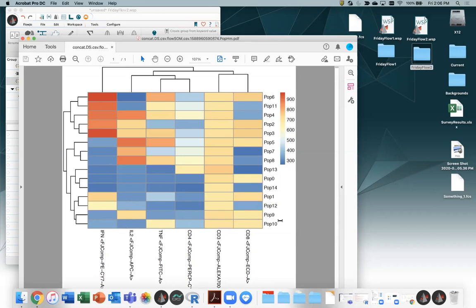So I immediately say, okay, that to me, biologically, is relevant. That is two different functional markers that have been excited. Those are two flavors of T cells that are distinct. And even if one of those populations is very small, then I believe it's a real cluster, and I'm going to keep up with it.